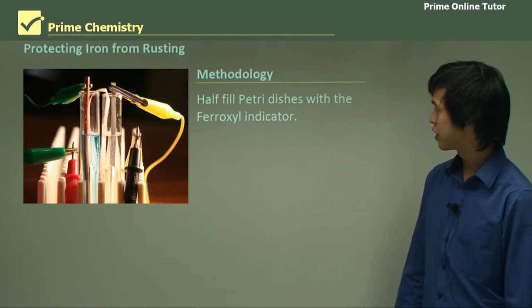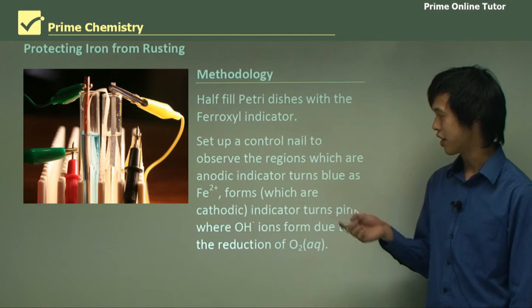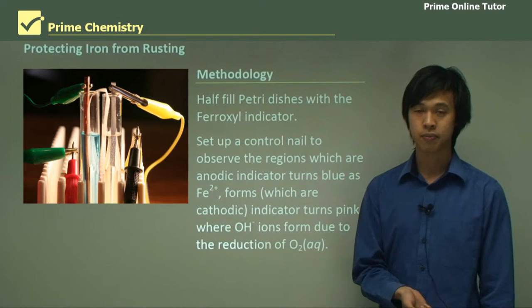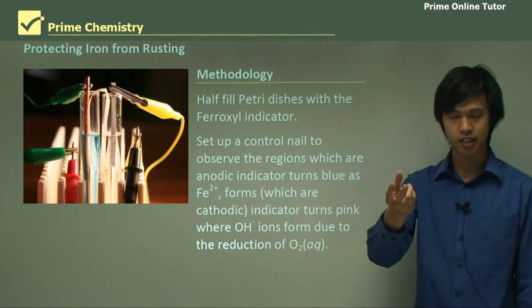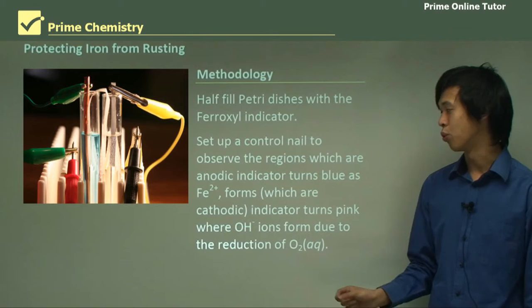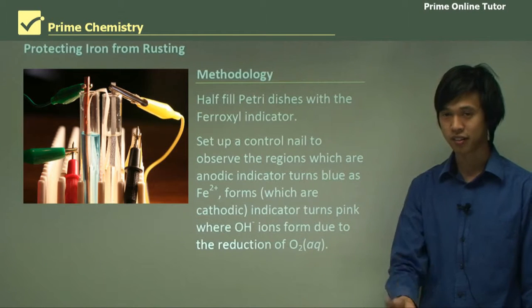So half fill petri dishes with the ferroxyl indicator. Set up a control nail to observe the regions which are anodic. The regions that are anodic will obviously release Fe²⁺ ions, because at the anode the iron is oxidizing, giving you Fe²⁺ ions. That ferroxyl indicator will turn blue when Fe²⁺ is present. That's why we're using ferroxyl indicator.